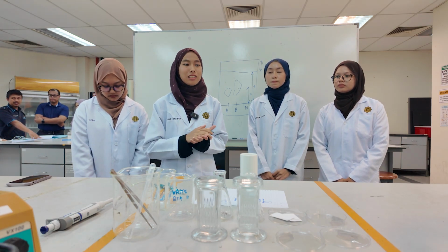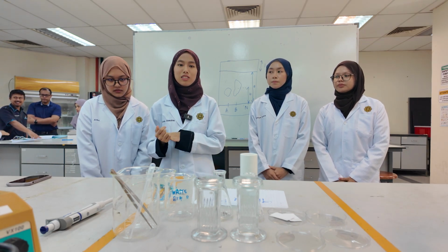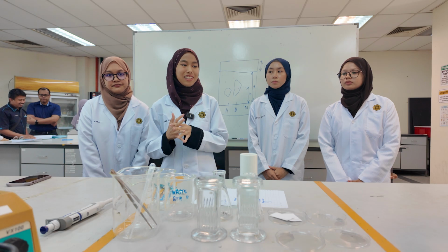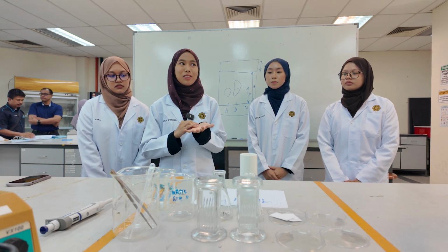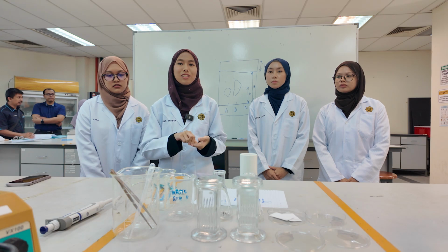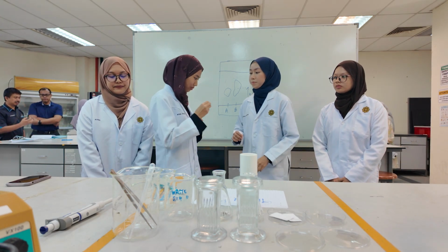Therefore, TLC along with the melting point is one of the solutions that offers us a quick and effective way to do this. So that's all, that concludes my part. I'll pass to the next presenters.